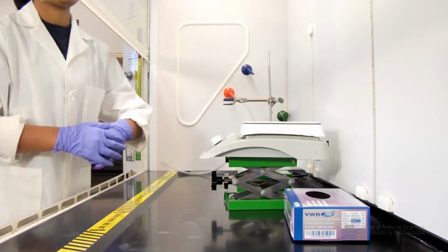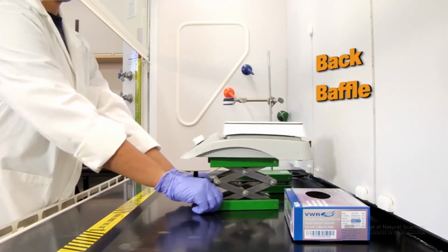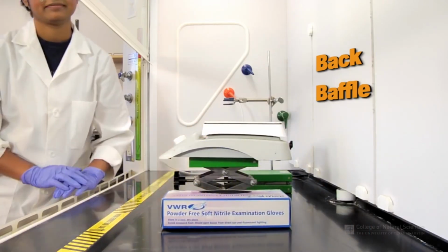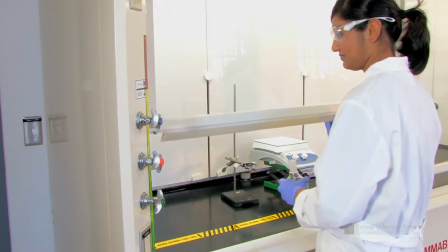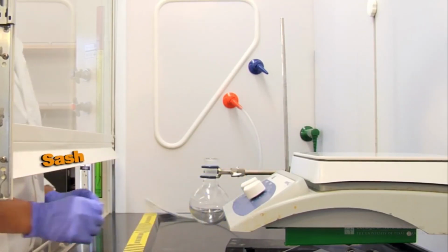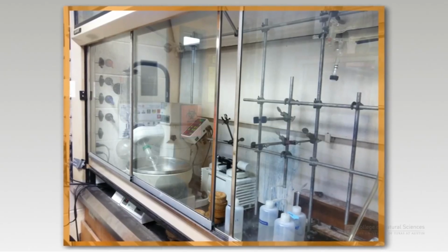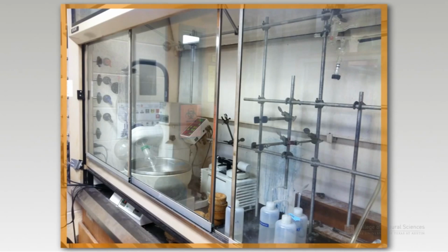First of all, the back baffle of the hood should not be obstructed. The back of the fume hood is where air flows through. Secondly, keep the sash as low as safely possible when working. This will minimize potential exposure to chemicals and protect you in the event of a spill or fire. If a combination sash is installed, do not open the vertical and horizontal sashes simultaneously.